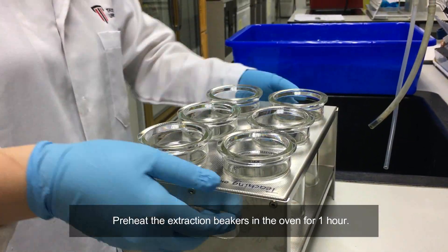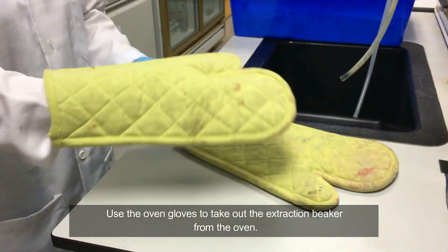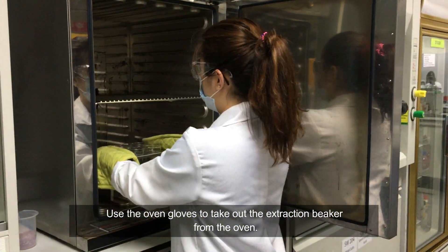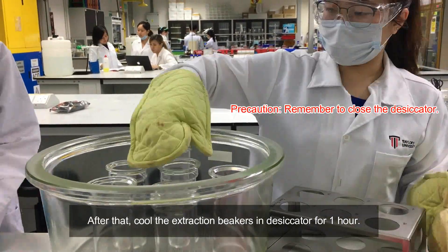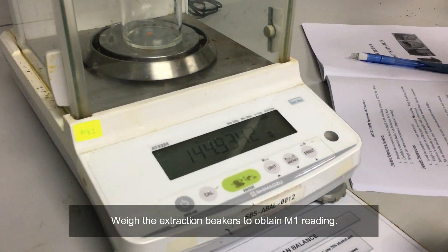Preheat the extraction beaker in the oven for 1 hour. Use the oven glove to take out the extraction beaker from the oven. After that, cool the extraction beaker in the desiccator for 1 hour.